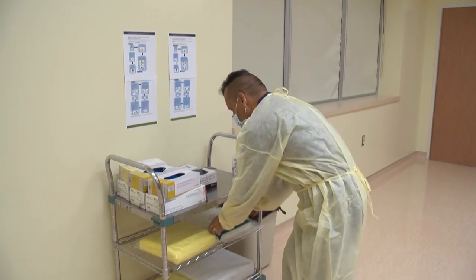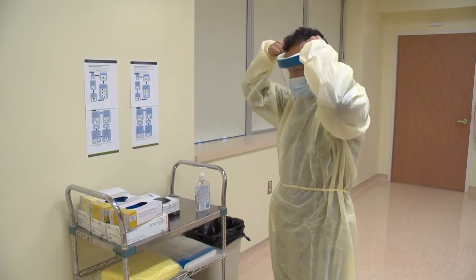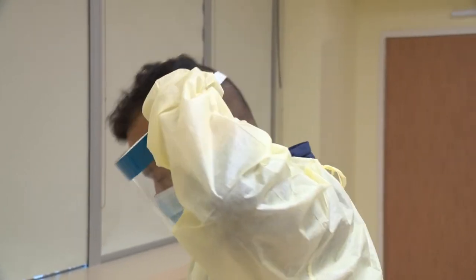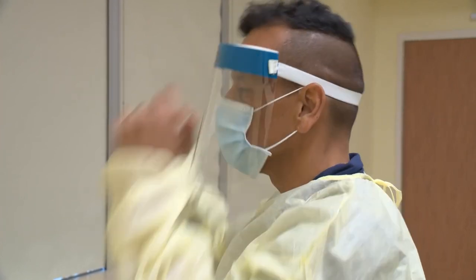Now, put a face shield over your mask to protect your face. To do this, slide the band over your head and secure it at the back of your head, making sure it is not twisted. Adjust the face shield so the top is resting on your forehead, so your face will be well protected.